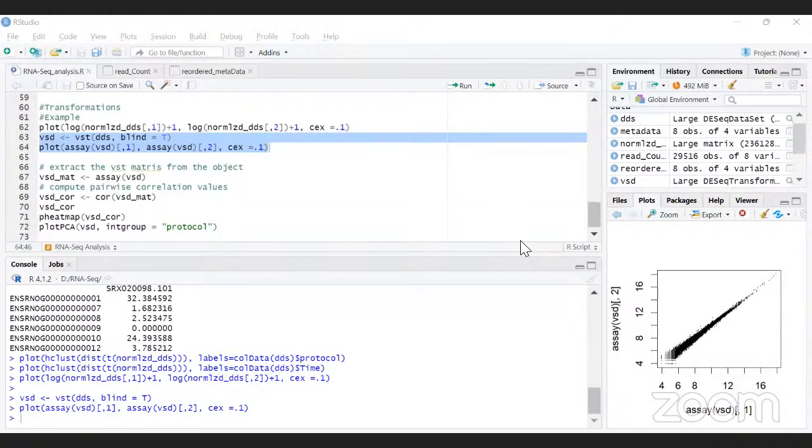So these kinds of transformations are very important when you want to do any exploratory data analysis. If you simply use normalized counts, actually this data is very good. With only normalized counts, you're just normalizing the counts, trying to do hierarchical clustering, and you're able to see the groups that you want to see. But in most cases, this does not happen. So what you would want to do is apply the transformations.